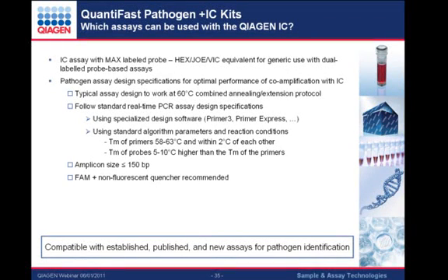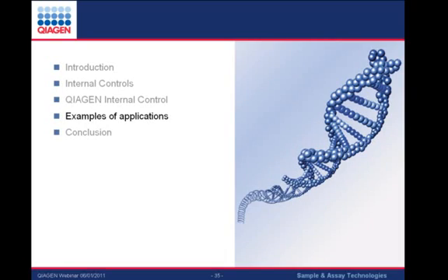These recommendations all correspond to the standard design recommendations which apply for the design of efficient real-time PCR assays. So therefore most assays in literature and self-designed assays have been designed according to these guidelines anyway. Therefore the internal control is compatible with most established or published assays.